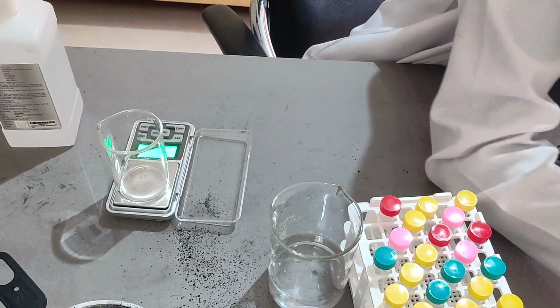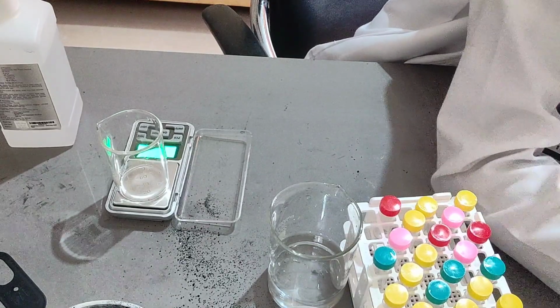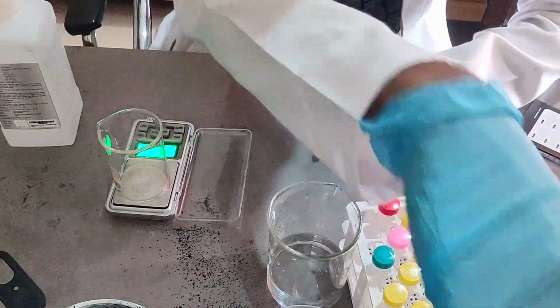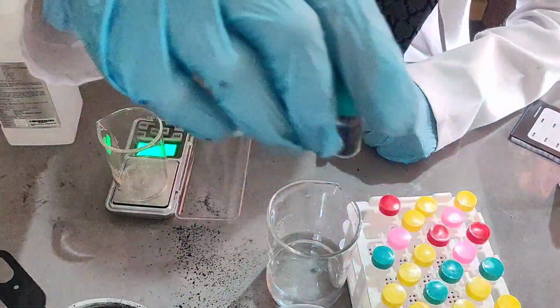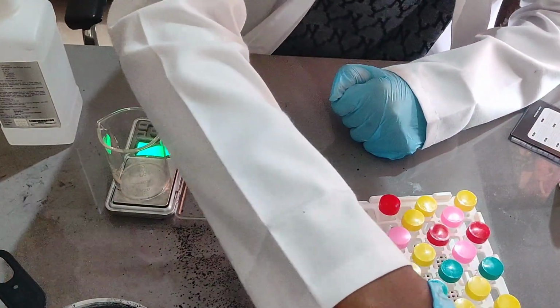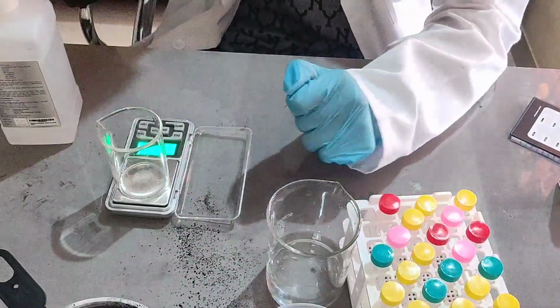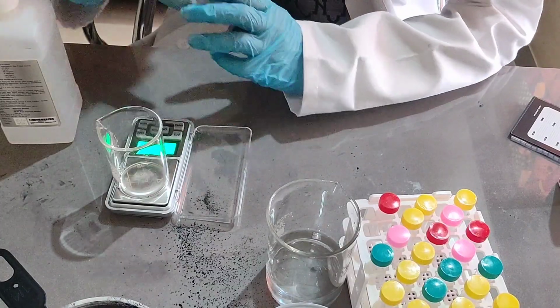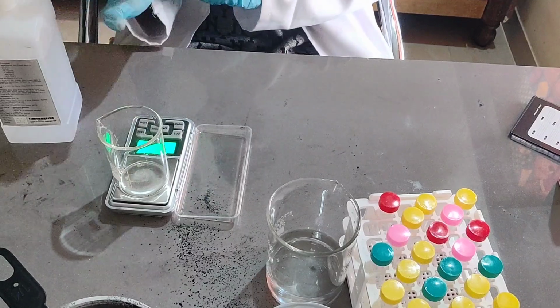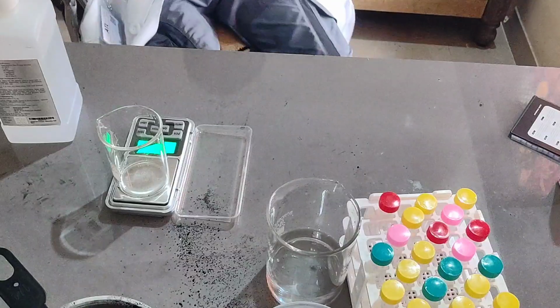Okay. So currently I'm making crafts and all. So again, we are going to do what we did yesterday. If we find out the issue behind the graphite falling out of the suspension, then we would definitely change the methodology of making the suspension and do another test, testing it with ethanol and isopropyl alcohol in different concentrations of graphite. But right now, let's just keep the thing the way it is.